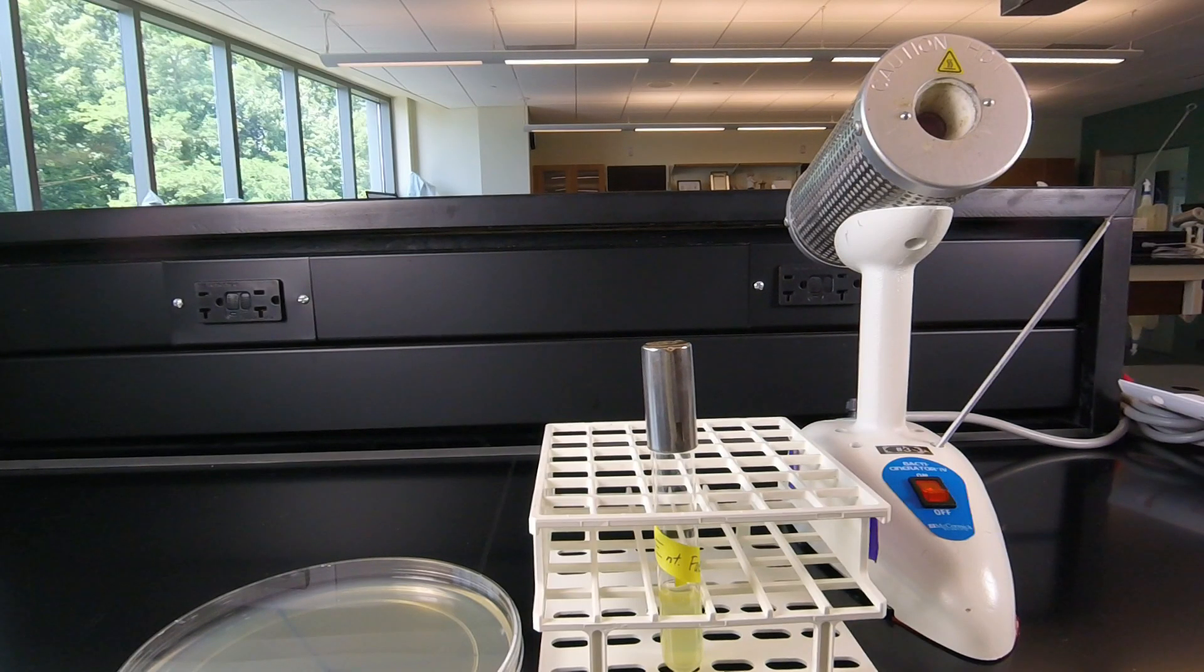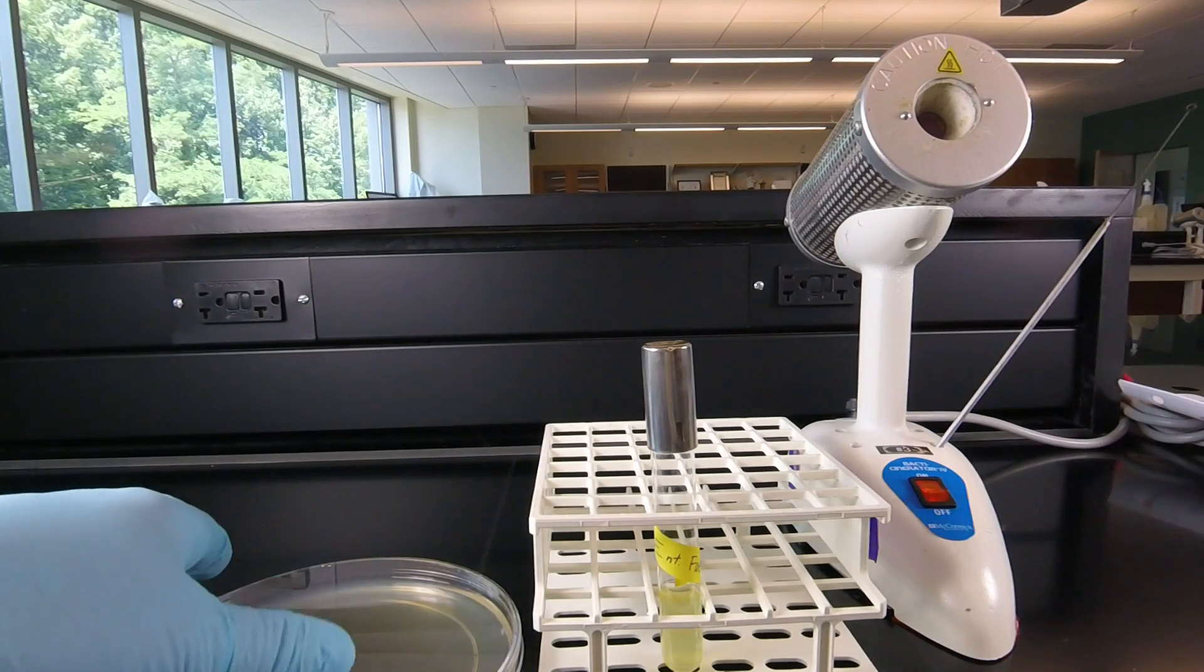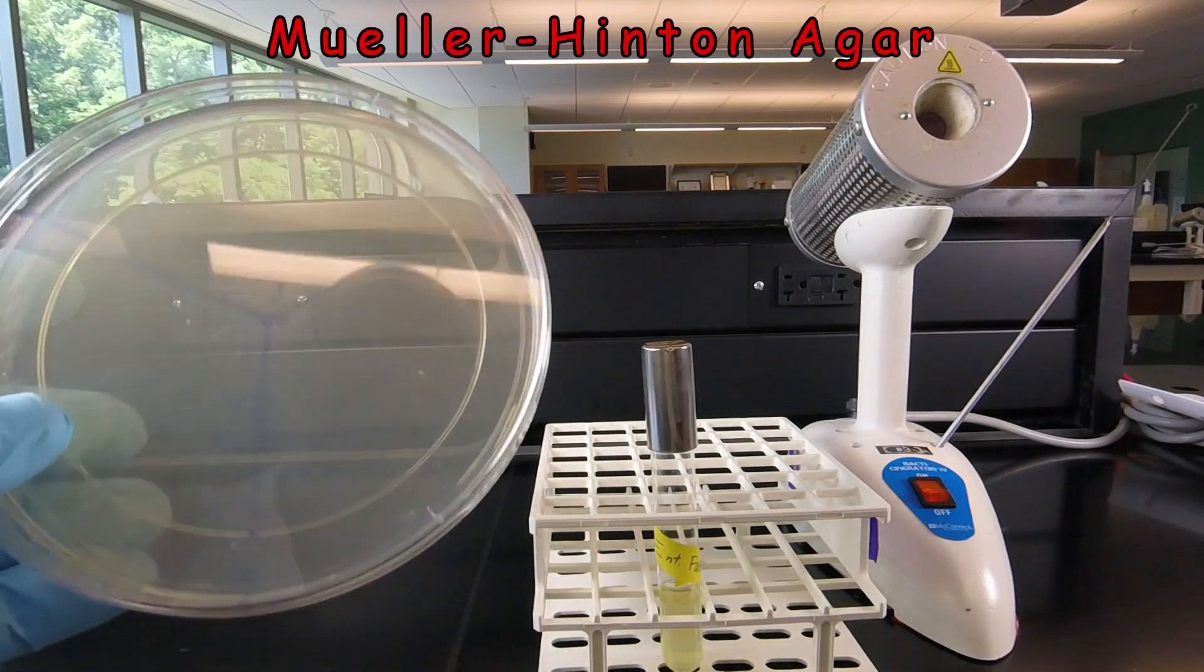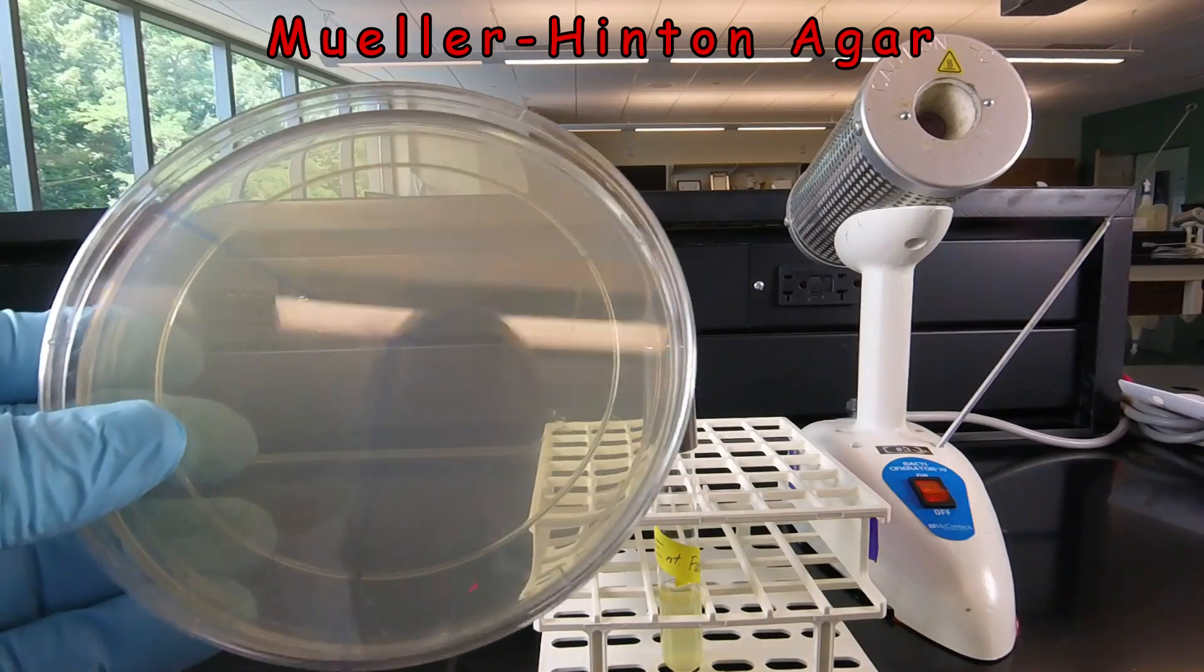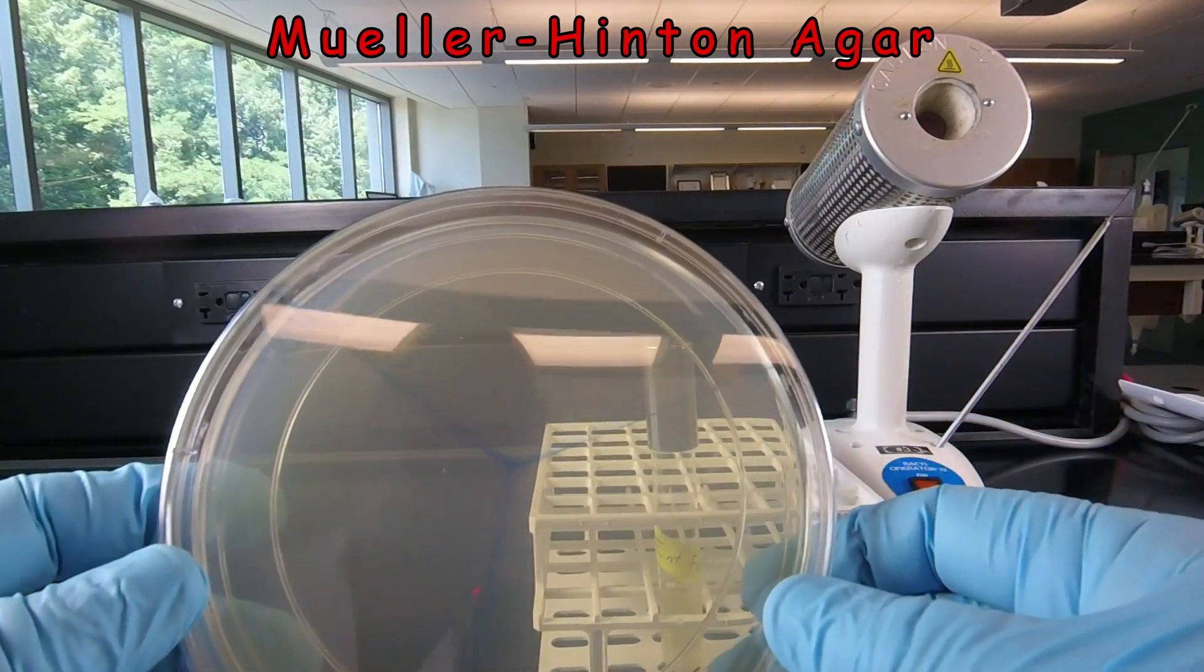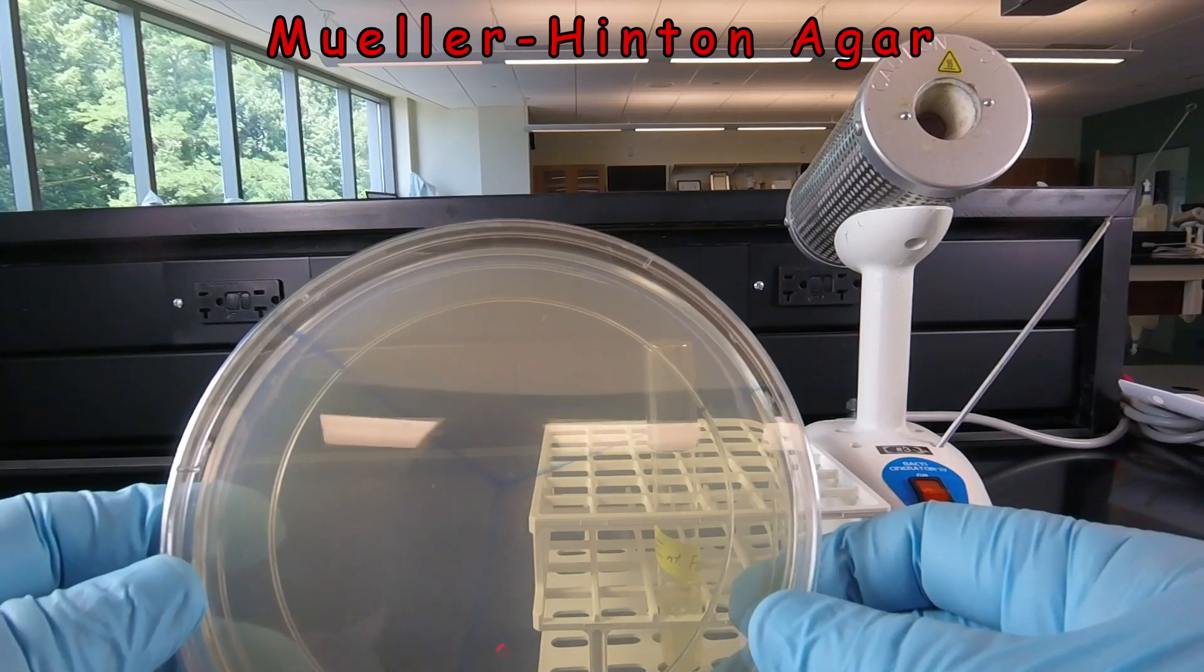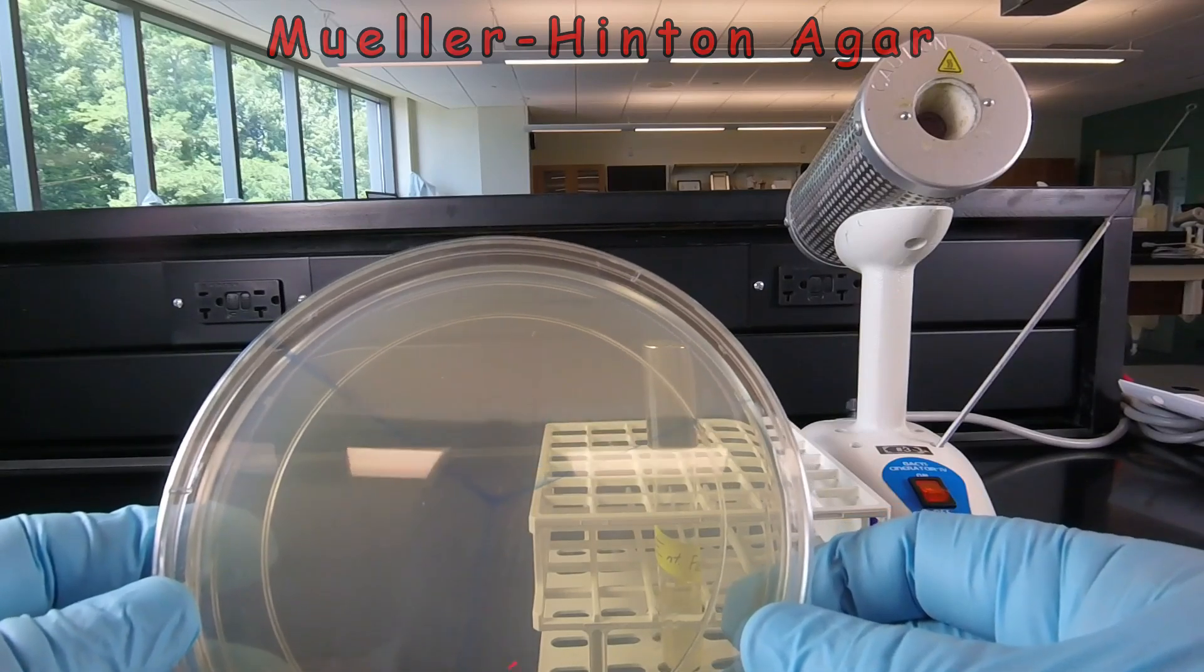In this video lesson, we're going to learn how to do the Bauer-Kirby method of antibiotic susceptibility testing. For that method, we use a standard size agar plate called Mueller Hinton Agar, and these are the large 150 millimeter plates that will hold 12 different antibiotic discs.